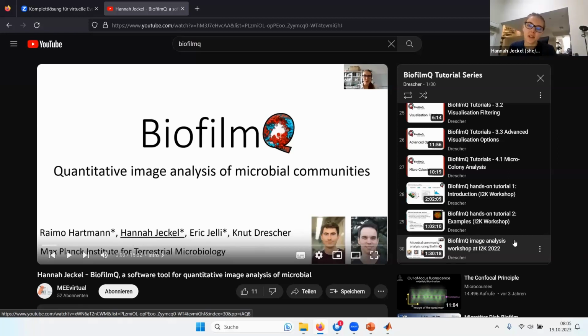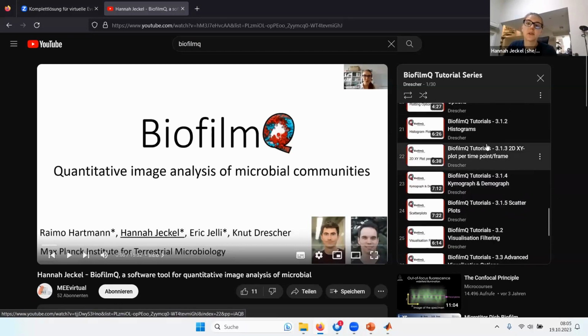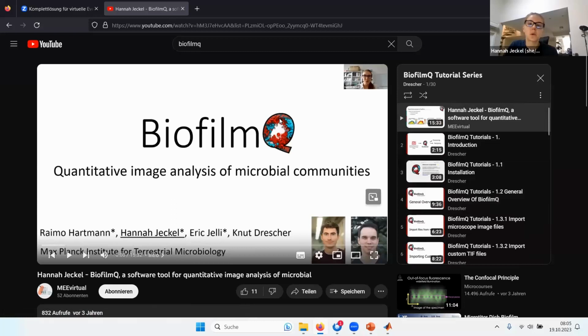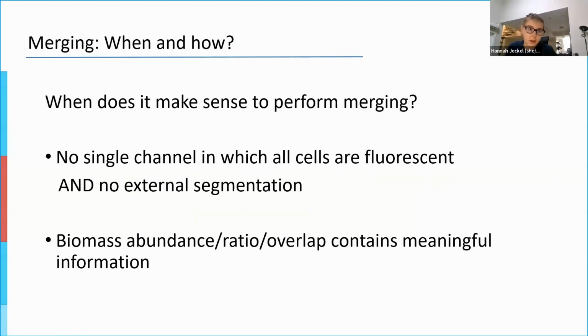So this is where you can sort of get started if you don't have much experience with BiofilmQ yet, or you want to look at some specifics of it. We have a lot of different tutorials for a lot of different features. So this is really a good place to start, aside from, of course, the documentation, which is also quite useful. So yeah, I will start by talking about merging.